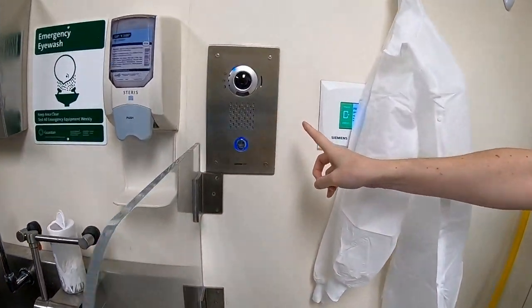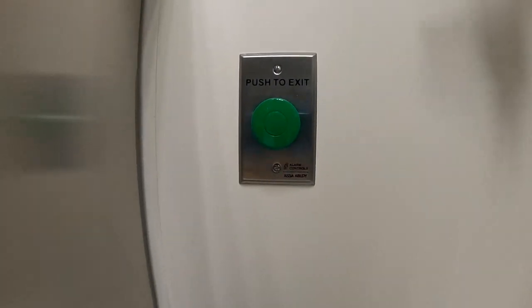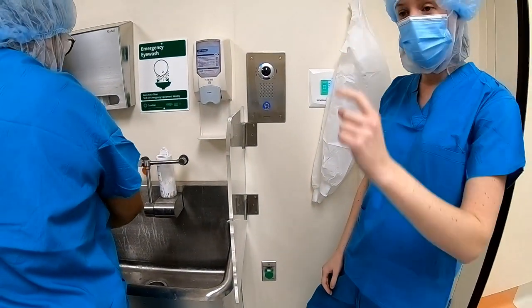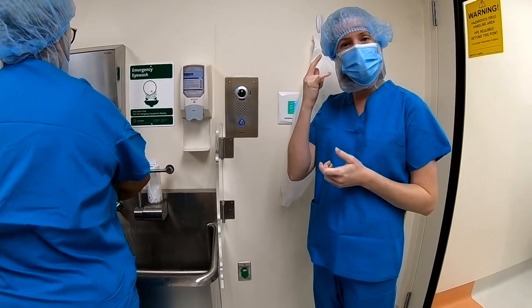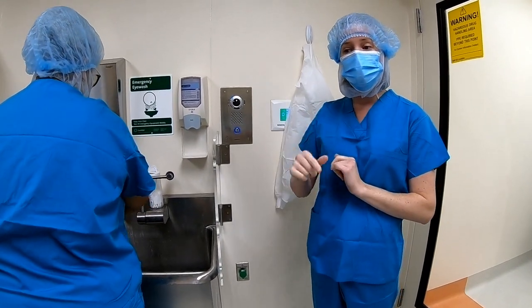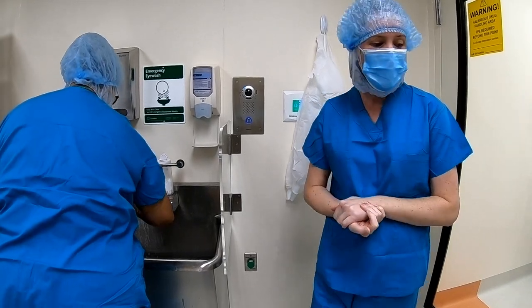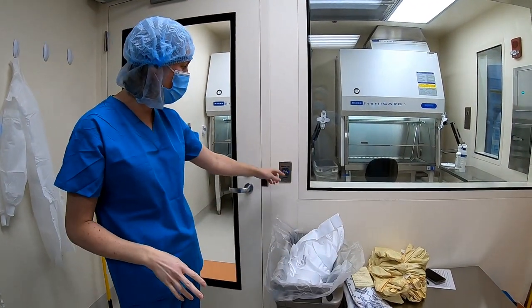Over here is the intercom system. You can press the button to talk or use the knee pad to talk — it is not actually a push-to-exit; they used a generic faceplate. To call the pharmacist desk out at the front, just hit the knee pad once and it will start ringing. As soon as the pharmacist picks up the phone you can start talking to them. Likewise, if the pharmacist calls from inside, you can just start talking back — you don't need to answer any calls. All of the doors on the inside have a wave-to-open feature.